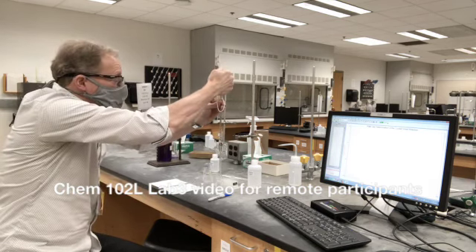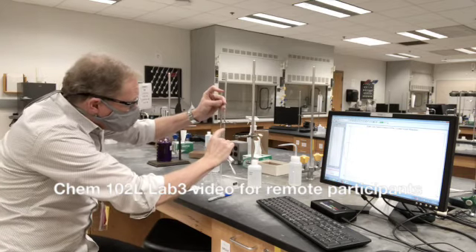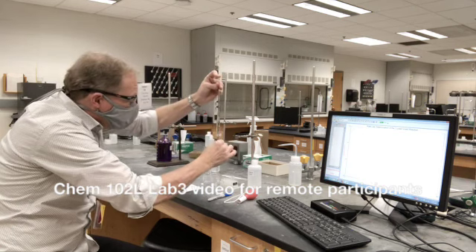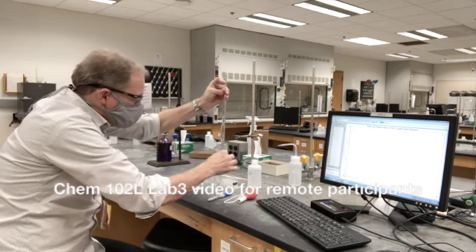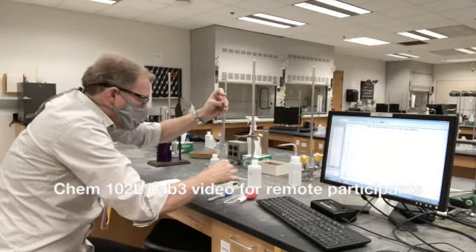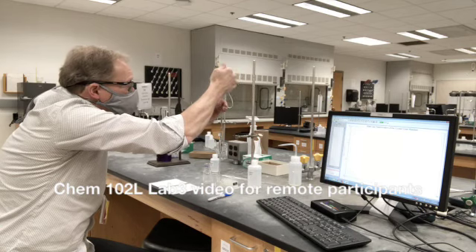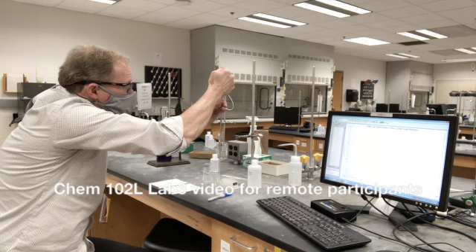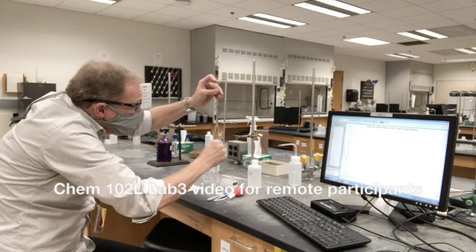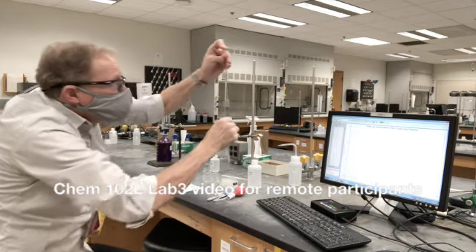I'm going to squeeze my bulb a little bit and bring it up above the mark with some control. Let go — and now I have it above. Now I have the meniscus. I'm letting it fall just a little bit with a little release of pressure and I'm right there. I've actually gone a little bit below my mark, so I'm going to bring it up again. This just shows you that even someone who does this a fair amount of the time has to go back and forth. I'm watching this meniscus, putting some pressure on my finger to keep it sealed, and sliding it just a little bit to get that meniscus right there.